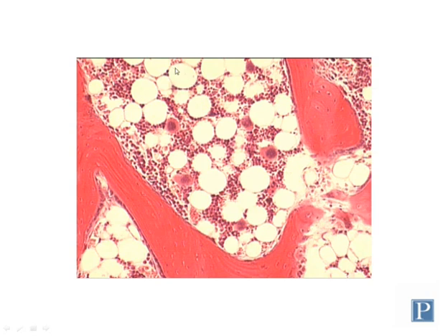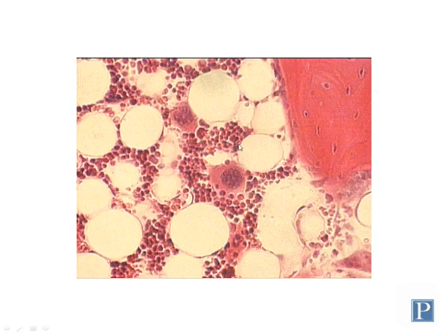These large white appearing cells, these are adipocytes. You should be able to recognize those by now. Here's a higher magnification view. You can see just tons of erythrocytes or red blood cells in this bone marrow. So this is composing the red marrow. Yellow marrow is composed of adipocytes. So this particular bone section has both yellow and red marrow. As most bones age, the red marrow is replaced mostly by fatty adipose tissue or yellow marrow.